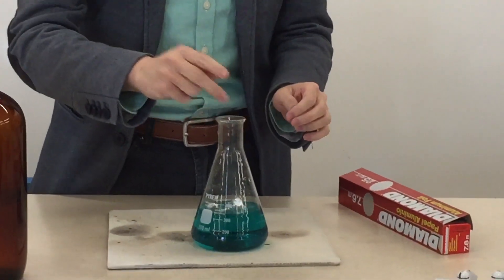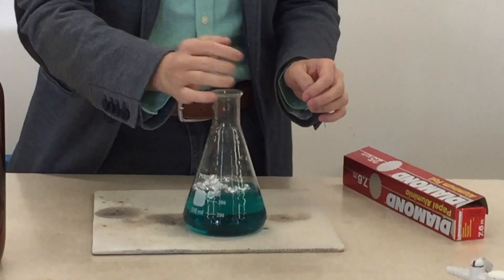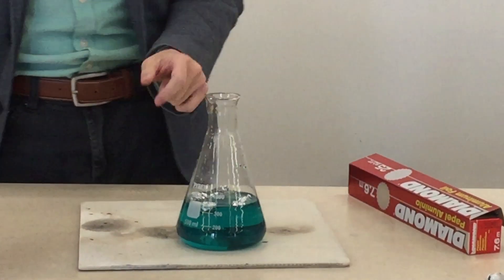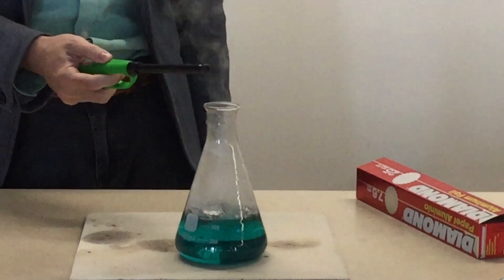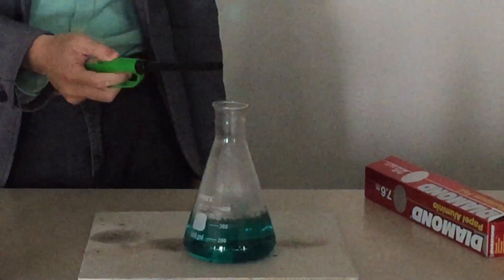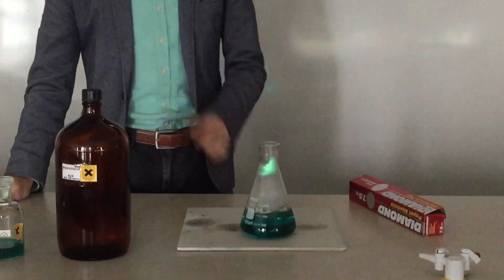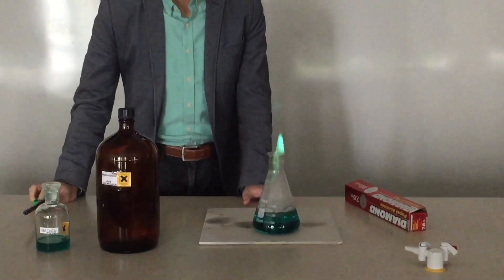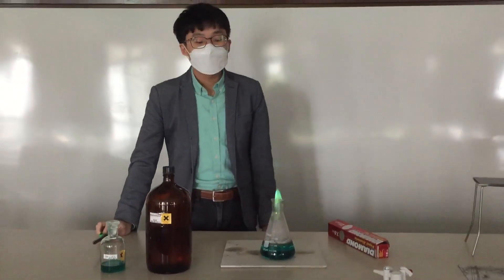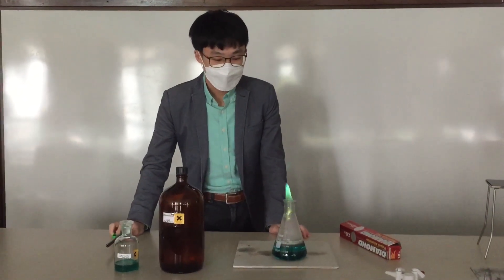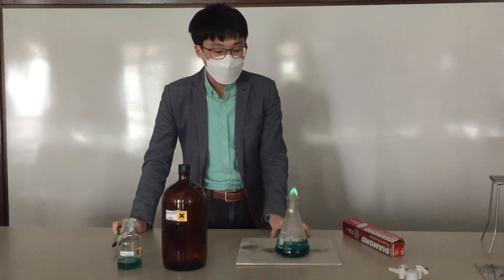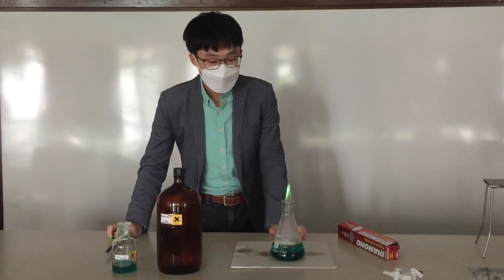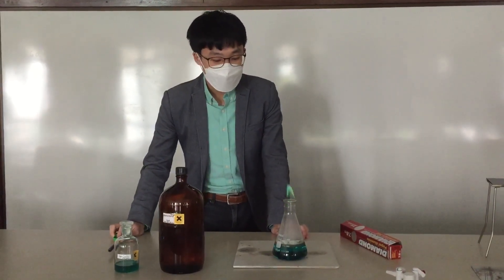You can see we are going to add some aluminum foil in it and it starts bubbling a little bit. We are going to switch off the light and light it up. This is called the Northern Lights demonstration, and you are going to see a very beautiful bluish-green flame in the conical flask.